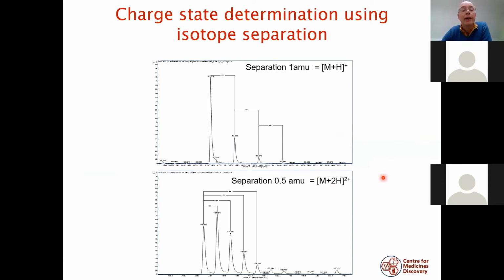You may need to identify the charge state. If you're familiar with working with proteins, we would have multiple charge states and we will deconvolute those charges. You don't generally need to do that with small molecules because the spectra are simpler, there are fewer charge states, but you can still have multiple charge states. And they're quite easy to work with.